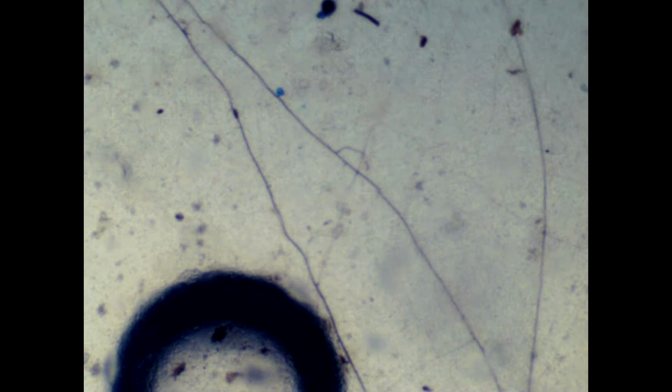And if anything, this definitely demonstrates that, yes, the bag is biodegradable. To what degree, I'm not sure. It will definitely take a long time before this bag is completely broken down, but from what we see here, it is definitely on the path to being completely degraded. So I'm going to call it good right here for this last microscope clip, and I will see you all right after this. So that was the mud sample under the microscope.